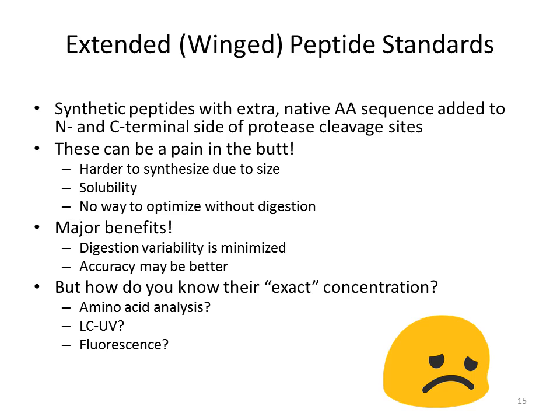Yeah. So the problem is that, remember when we had our little rules on peptides for targeting, we had that like 8 amino acids to 25 amino acids. Well, now add on like 6 to 10 more amino acids because that's how big they will be when they are synthesized in this form. So the bigger they are, the harder they are to synthesize. The likely less soluble they are because the more hydrophobic things you're adding onto it, the more likely the peptide's going to crumple up and it may crash out of solution or stick to the tube walls, especially at low concentrations. And once you get it and it's synthesized and somebody gives it to you, there's literally nothing you can do with it until you digest it.